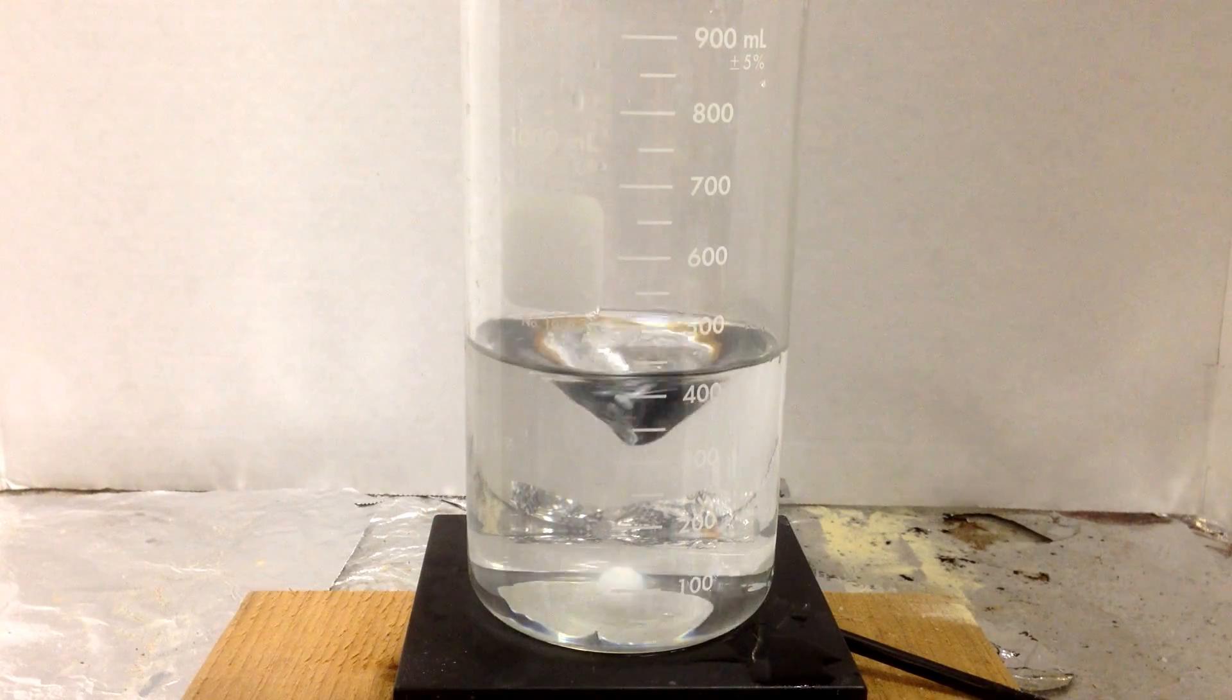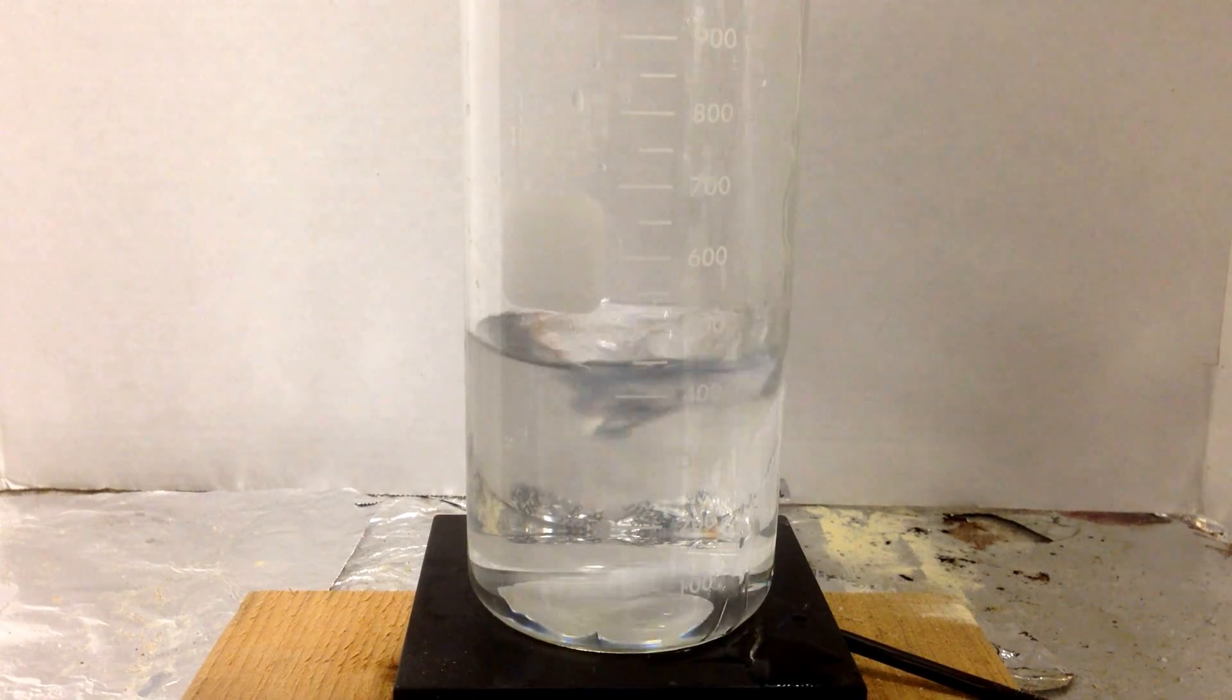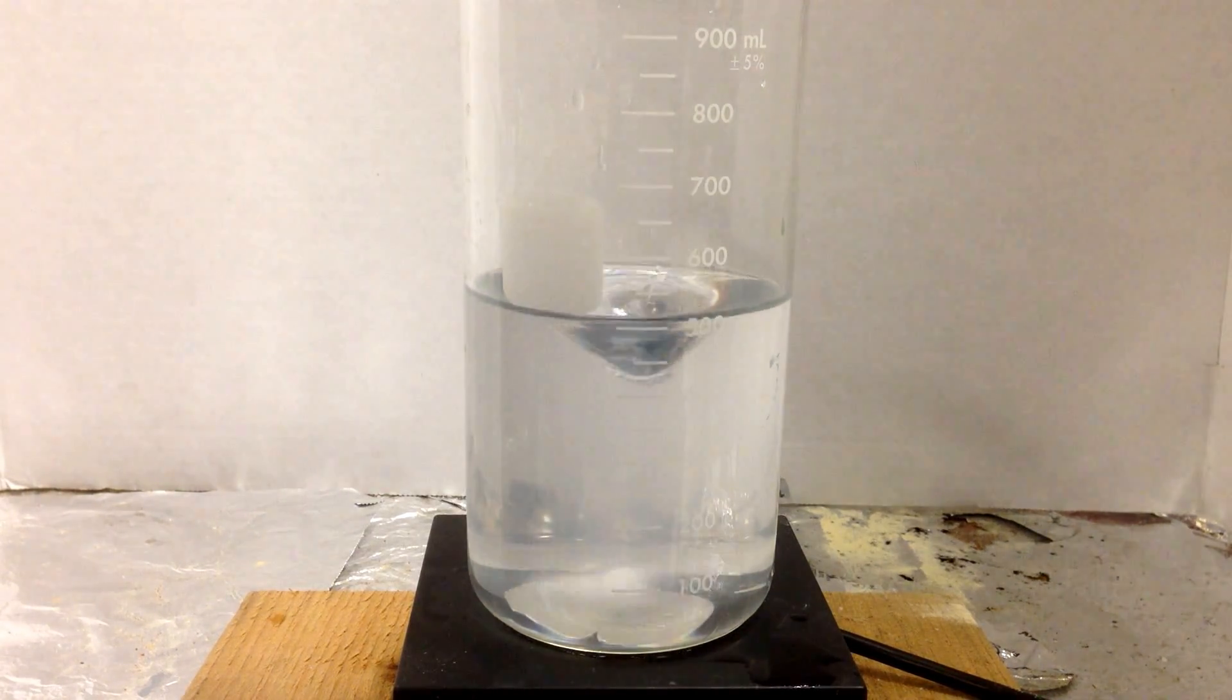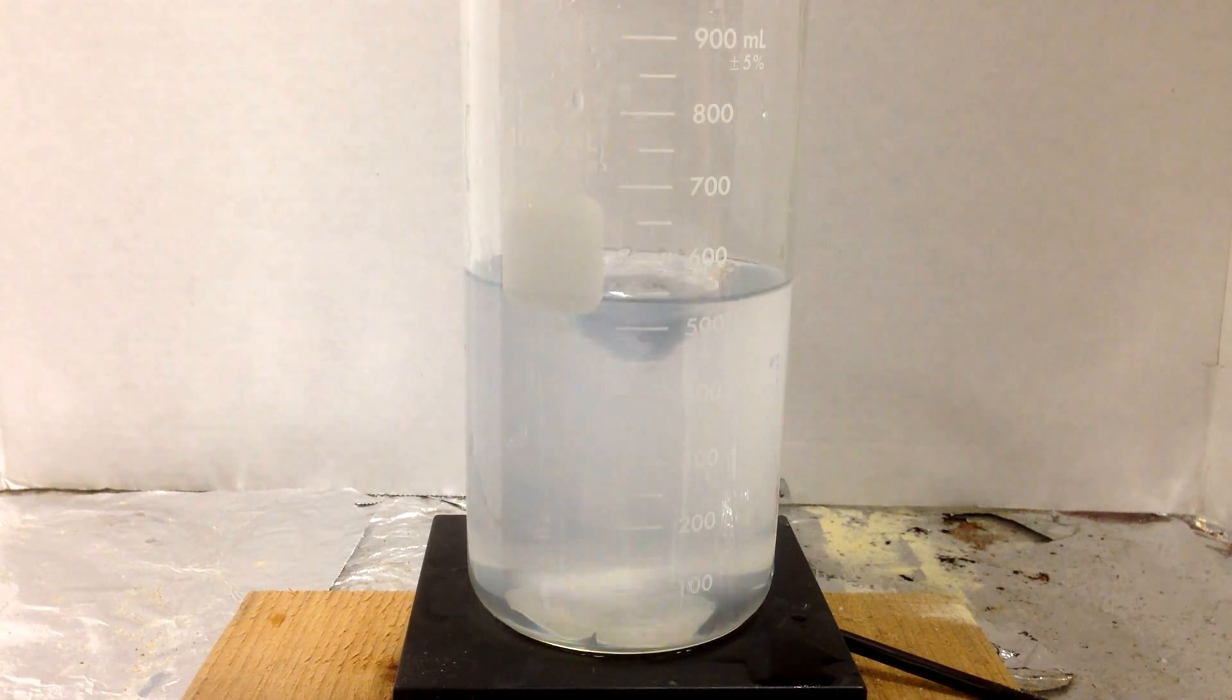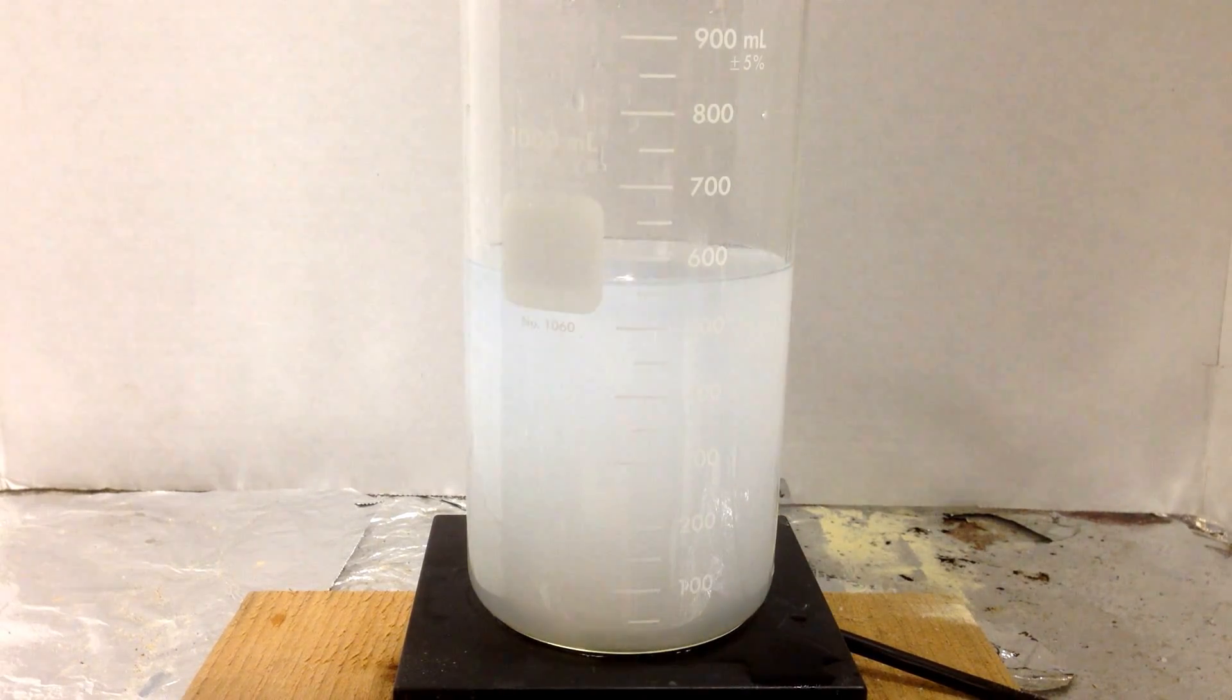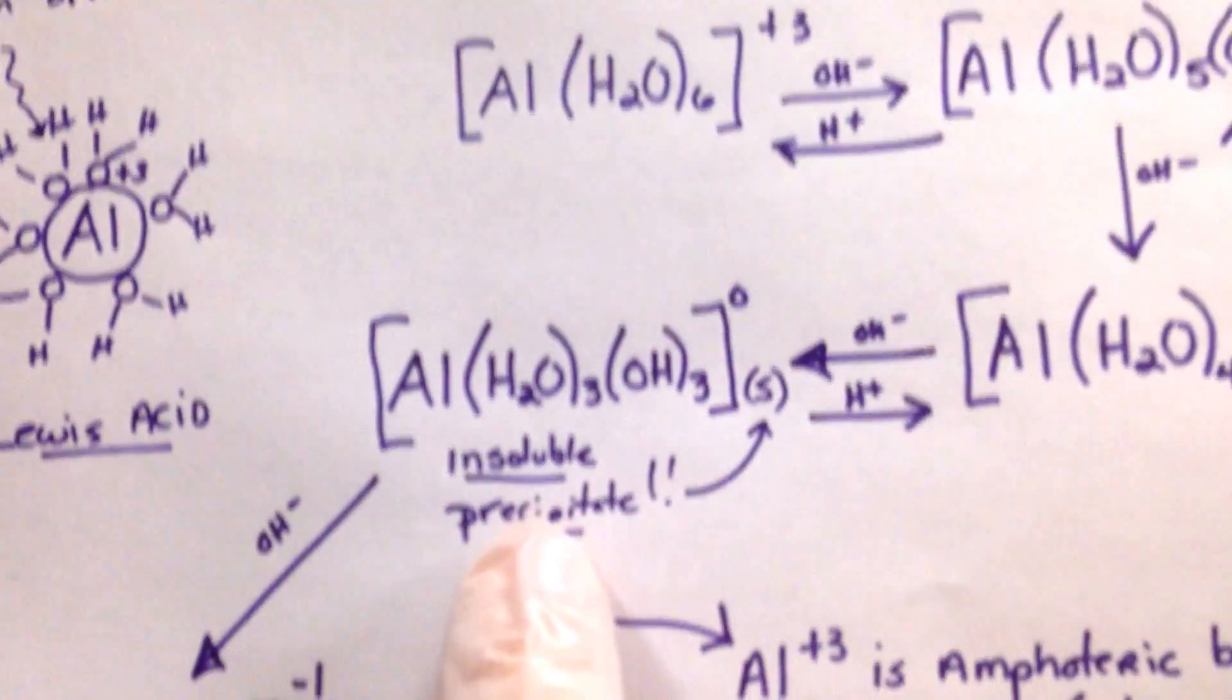So let's add some more base and recreate the scenario where I'm going to have some zero charged complex. I had some acid probably left over. Not enough. Added too much acid. I'm still getting there. All right, there I'm back. Now, where do we talk about why is it amphoteric? Here we go.